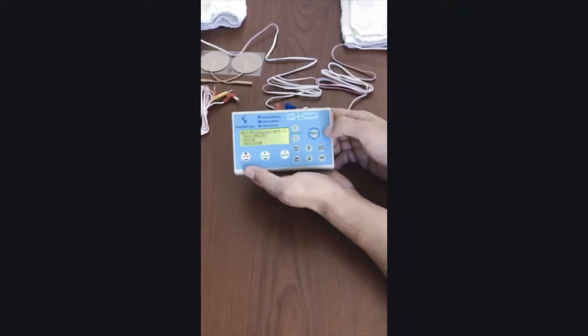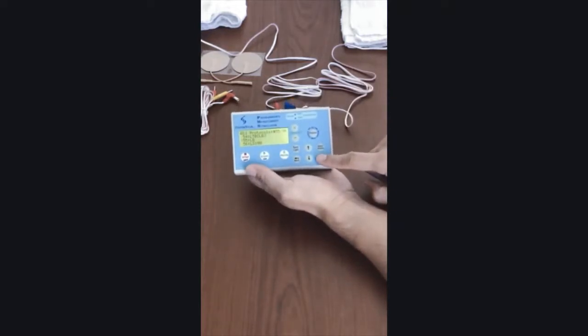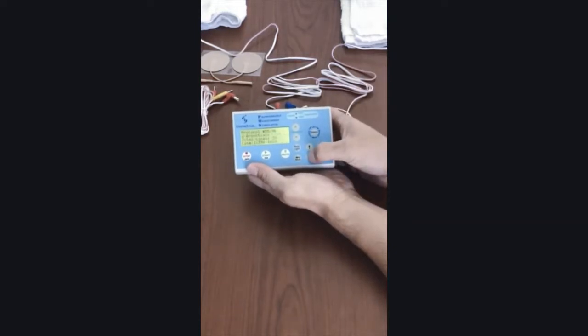You can see the details of a protocol by pressing the right arrow key to see the details. Use the up and down keys to scroll the screen to see the rest of the details of the protocol.